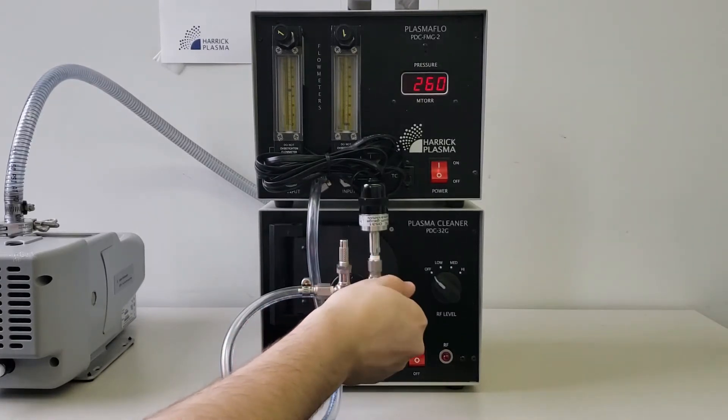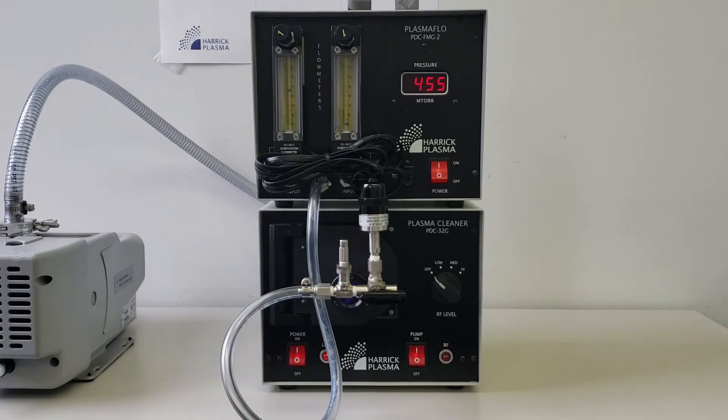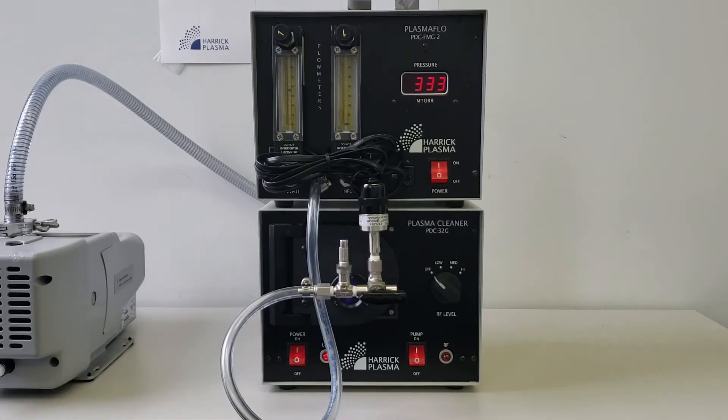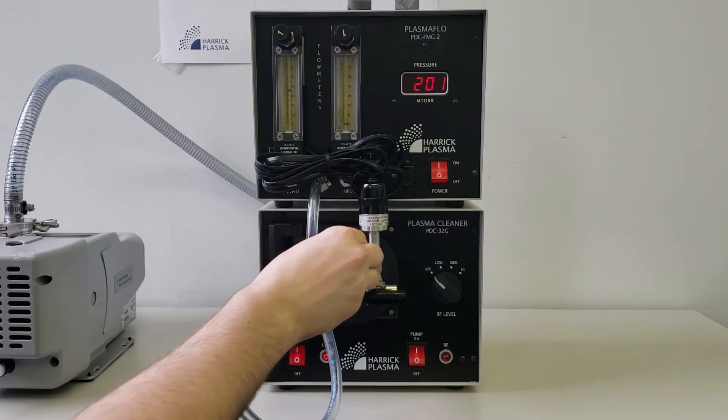Open the three-way valve to the metering valve. The vacuum pressure will rise momentarily as the ambient air between these valves is pulled through the chamber. Slowly open the metering valve about one-quarter of a turn to allow airflow into the chamber.